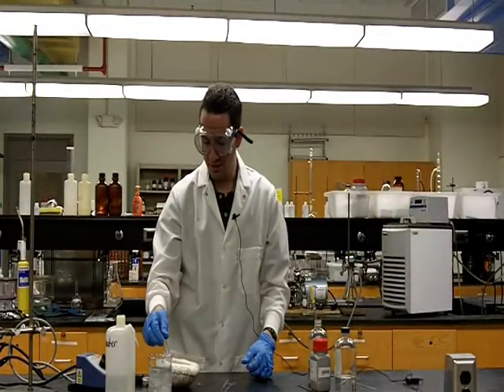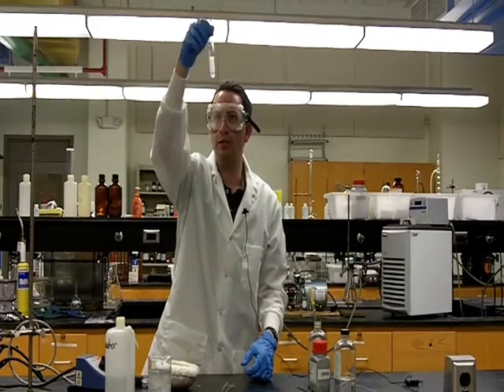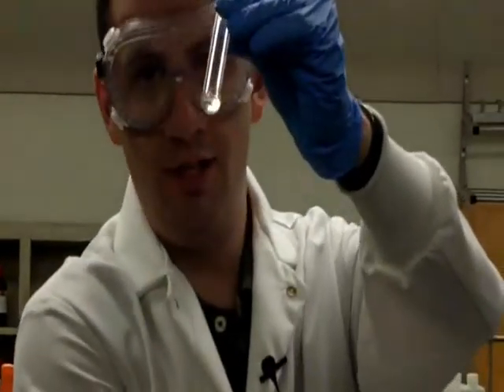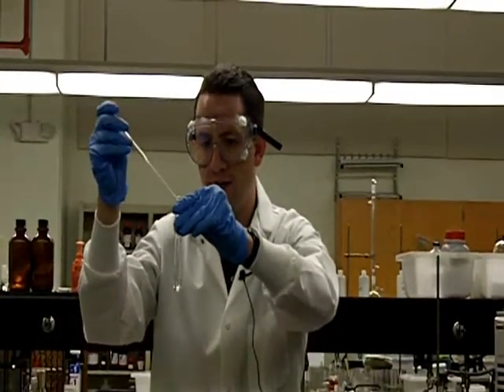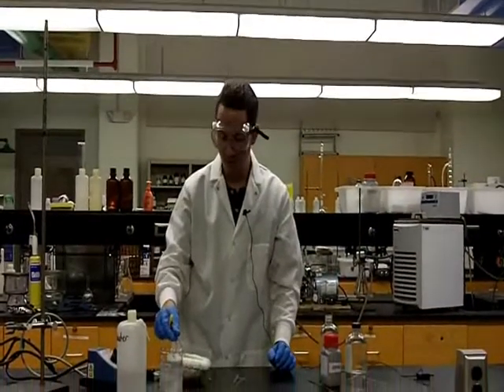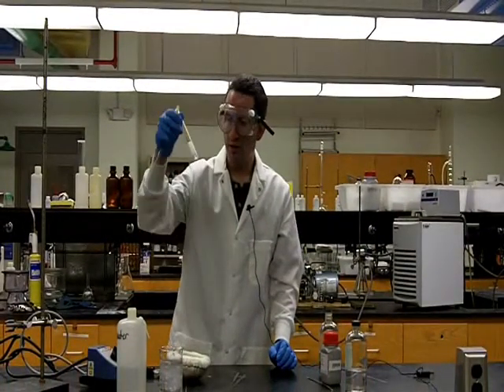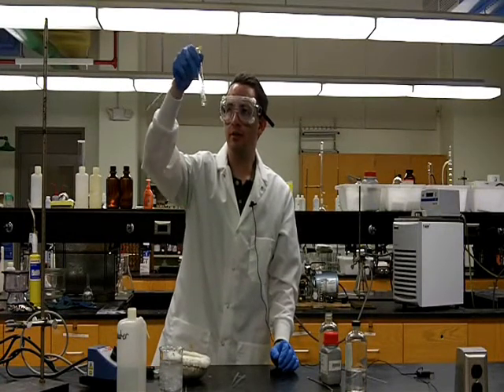Not all of it has dissolved, so I've now added a small amount of additional methanol to see if that will completely dissolve all of the fluorene. As we look more closely, we can see that almost all of the fluorene has dissolved, and so again I'll add a small amount of methanol and put it back in our sand bath until it boils.